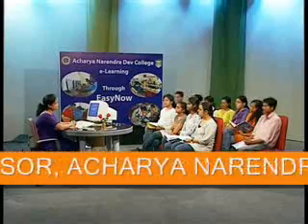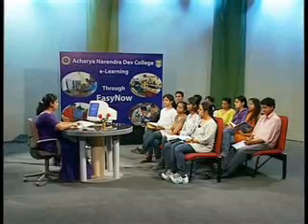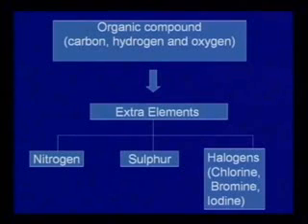Good morning, students. Today I am going to explain to you an experiment from organic chemistry, that is the detection of extra elements in the given organic compound. Now, as all of us know, organic compounds contain carbon, hydrogen and oxygen as the main elements. So these are the elements which are assumed to be present in the organic compound.